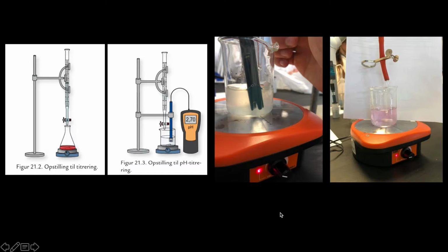Afterwards, we did it with lime juice instead of citric acid. We used sodium hydroxide and lime juice, and it looked kind of like this. With the red color in the colorimetric titration, it was kind of the same. We used 17.6 milliliters for that, and in the titration with the pH meter, we had an endpoint at not 19 but like 16 point something.